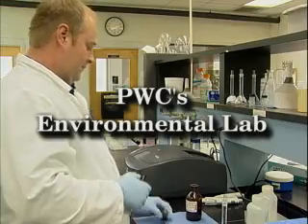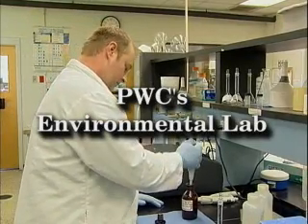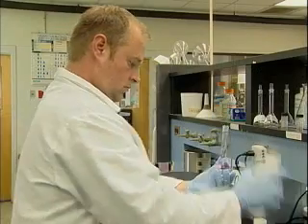Testing is very important in the water field and also the wastewater in the state lab. We are certified by the state, and each plant has a permit that's required with specific limits. Some of them we don't want it to exceed, and that's why we test different parameters.